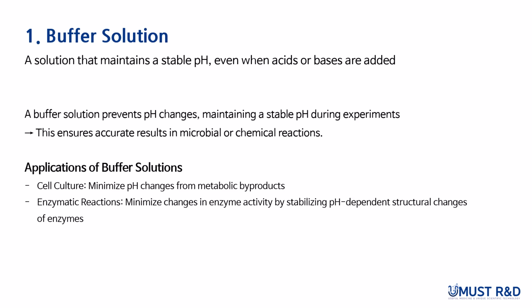First, a buffer solution is one that resists changes in pH when an acid or base is added due to the common ion effect. Since cells are highly influenced by pH, buffer solutions play an essential role in stabilizing the environment during experiments. For accurate experimental results, buffer solutions are critical.